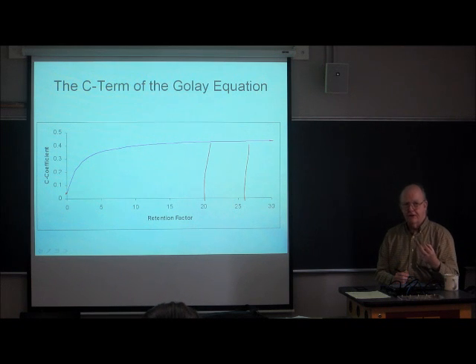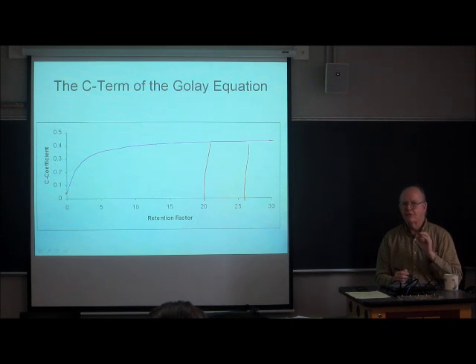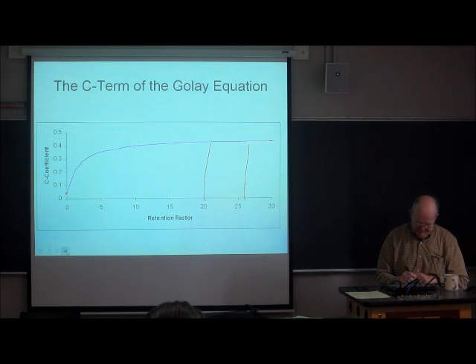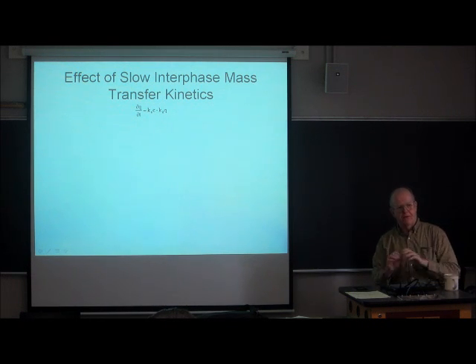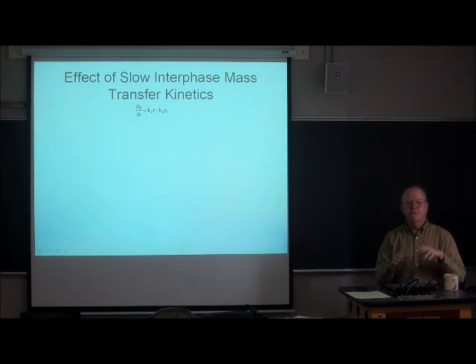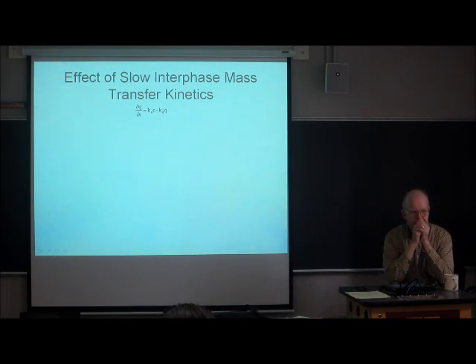That would lead you to think that you want to work at low k prime. But that would be a really, really bad idea, and I'll show you why it's a bad idea. But we've got one more issue to deal with before we get there. I had to make a big fat assumption to get that equation. I had to assume perfect equilibrium between the mobile and stationary phase.